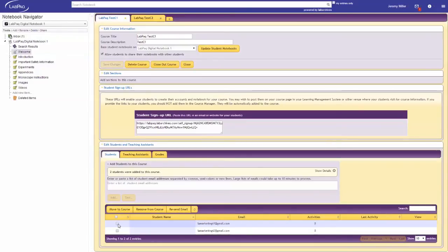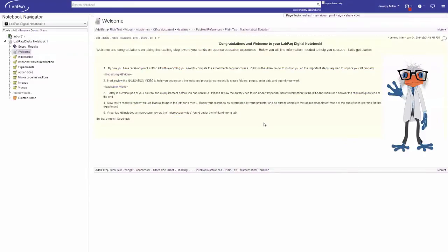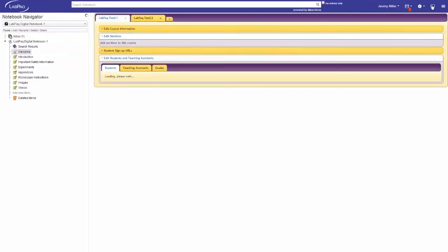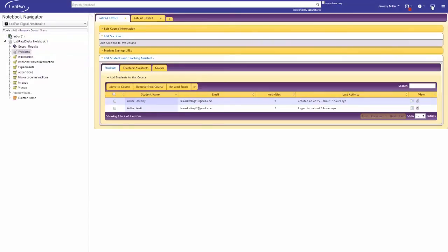Moving students allows you to change the course notebook a student has access to. Another instructor feature allows you to have access to each individual student's notebook. You'll be able to view and monitor the student's work in real time 24-7 by selecting their notebook from the course manager.